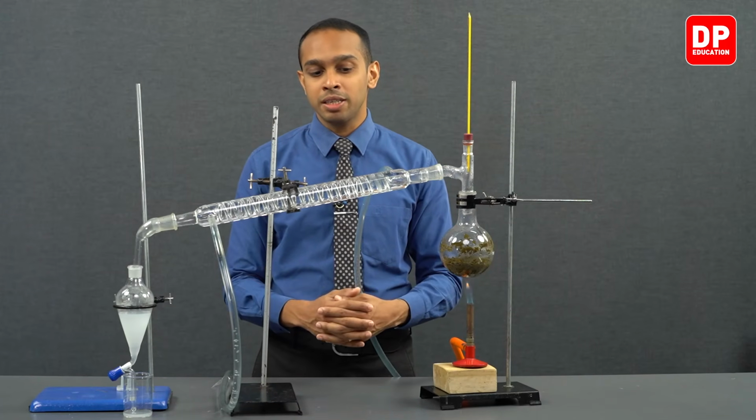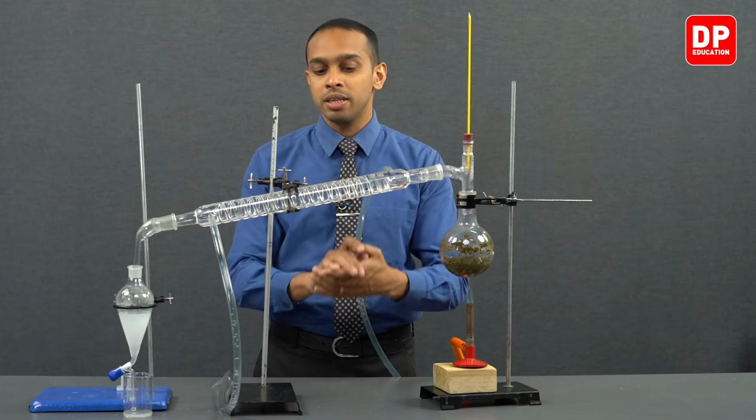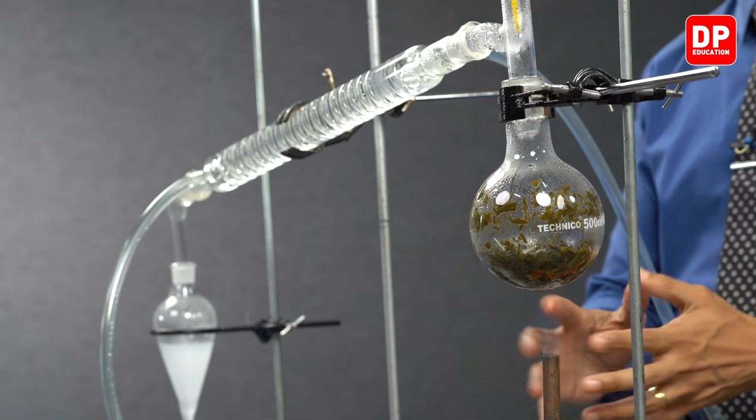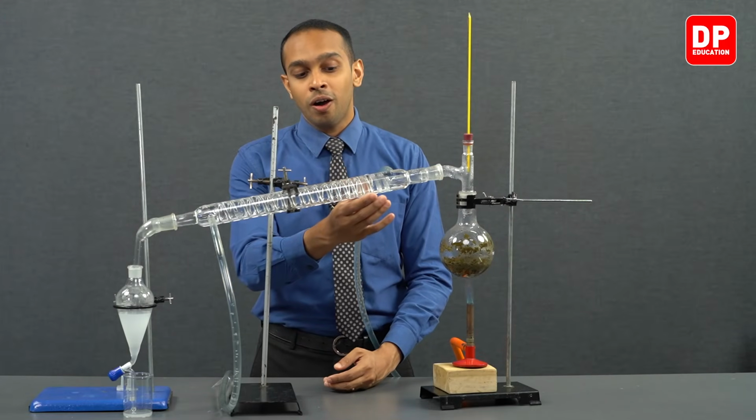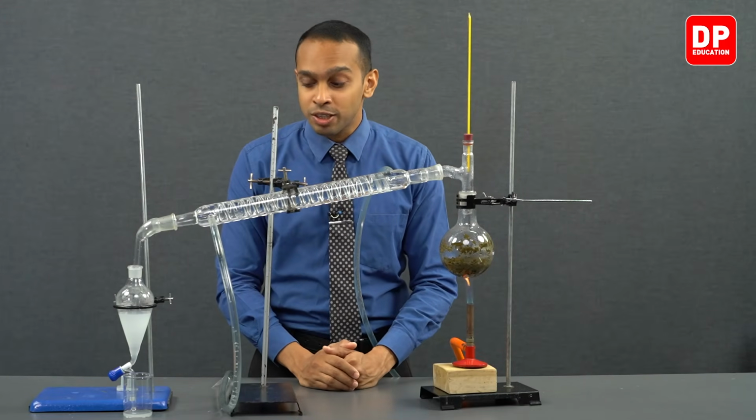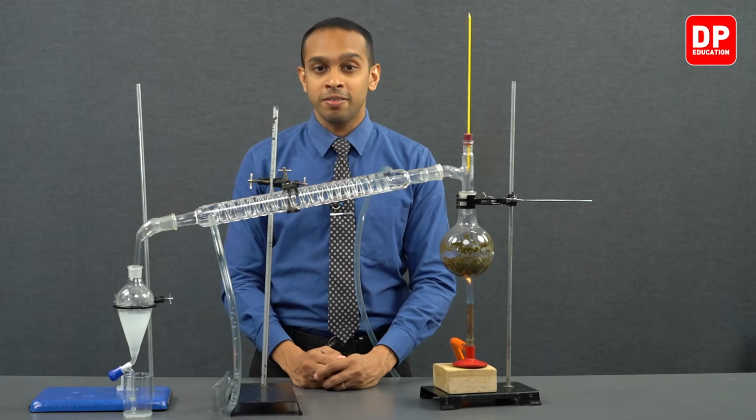So we will come again to meet you after we have separated the heat source from this setup, and after we have collected all of this liquid mixture into our separatory flask.